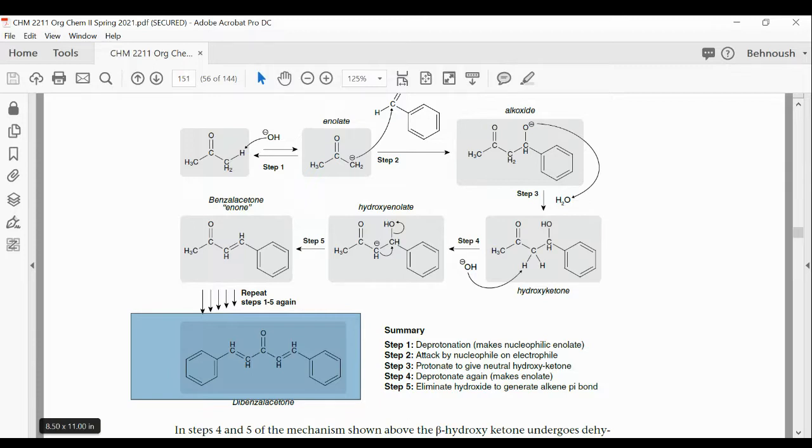When you are calculating percent yield, make sure you don't count the number of moles for both reactants, just the limiting reactant. And it's a 1-to-1 ratio to the product. So you find the number of moles of the product and multiply by 234, which is the molar mass for the final product, and you get the mass. That's the theoretical yield. Actual divided by theoretical gives you the percent yield.